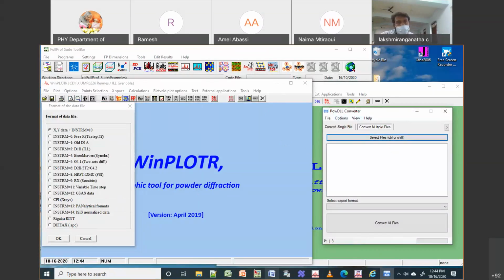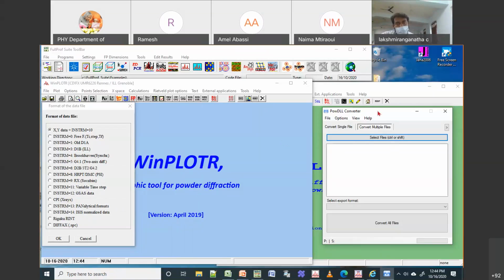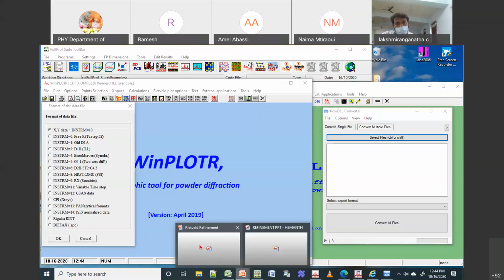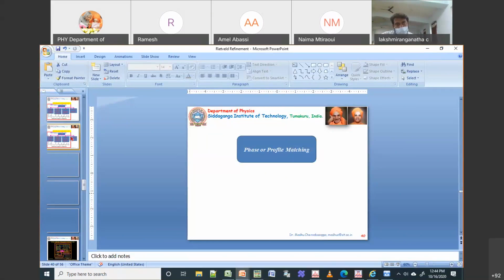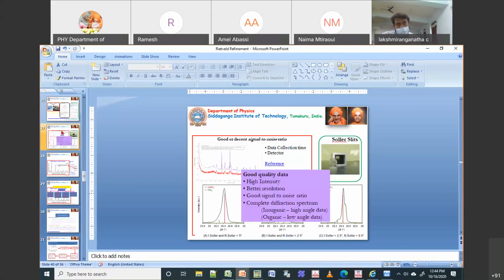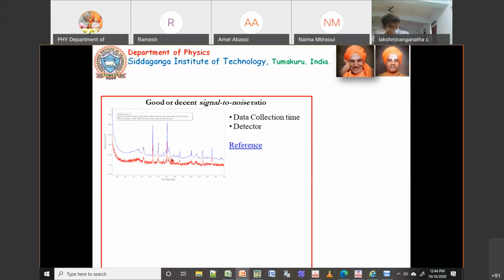But one more thing I wanted to share is, don't try to change your raw data. For example, if I go back here, say you're giving your sample to your X-ray operator. He is going to send you the data, which would look something like the red line. Okay. So you don't have too much time to do one more scan, so you ask your X-ray operator, or you may ask your friend, to do smoothing of this curve, the red curve, to get something like the blue one, because you want to reduce the noise. So in that case, what happens?